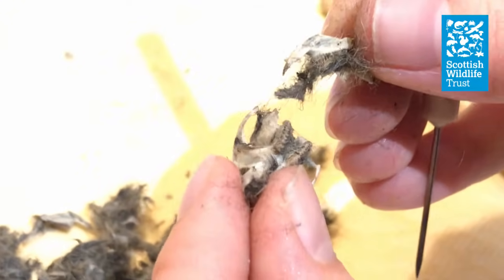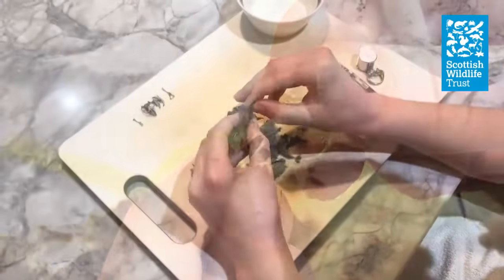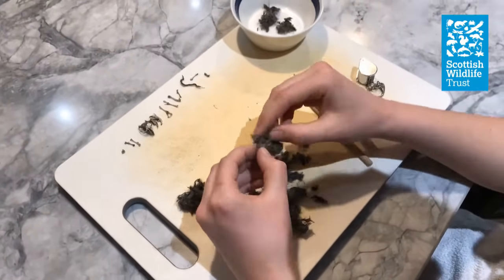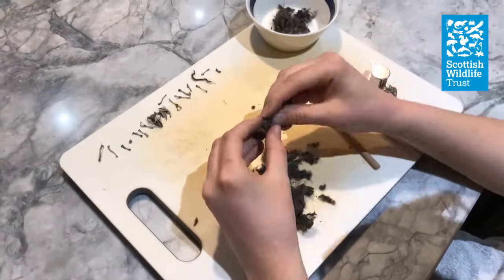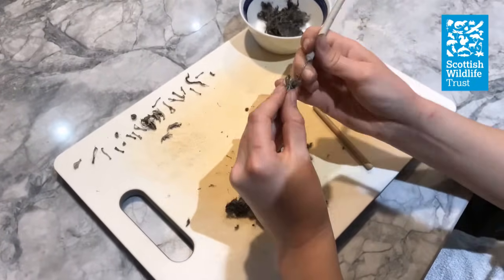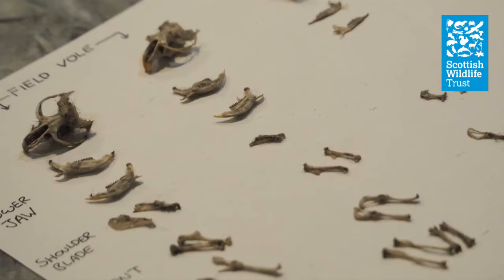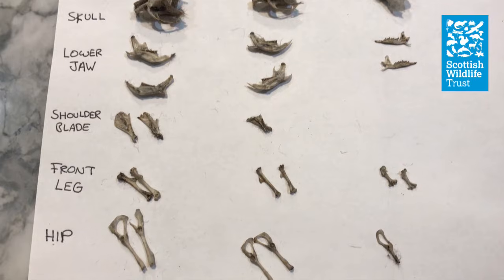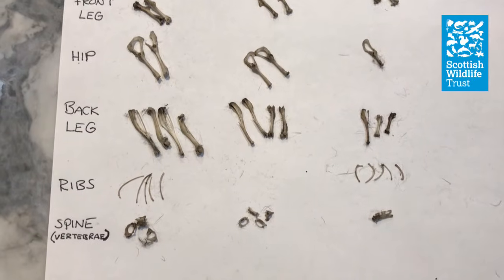What you're aiming to end up with is a nice clean skull with no fur left on it. Now you can go ahead and dissect the rest of your pellet — just take each piece between your fingers and feel for any hard bits. When you find one, start teasing the fur away to reveal the bone. Put any bones that you find to one side to identify later and you can discard the fluff. Once you've got all of the bones out of the pellet, you can start identifying them. I recommend putting the bones on a piece of white paper so that you can see them clearly, and you can also write what each is once you've identified it.